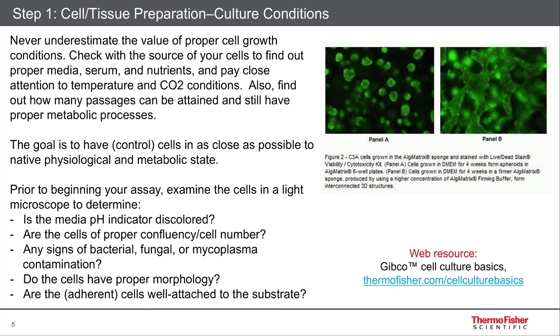Prior to beginning your assay, here is a list of some things to really consider. Examine your cells. Make sure that the pH indicator is not discolored — phenol red is most common and it will have a pinkish color. If the pH starts to go off, you'll see that it turns yellowish. Are the cells of the proper confluency or the proper cell number for your assay? Some assays require that the cells are totally confluent and have contact inhibition going on. Are there any signs of bacteria or fungi? Do you have any strange floaties floating around in your cells to indicate that there might be some contamination?